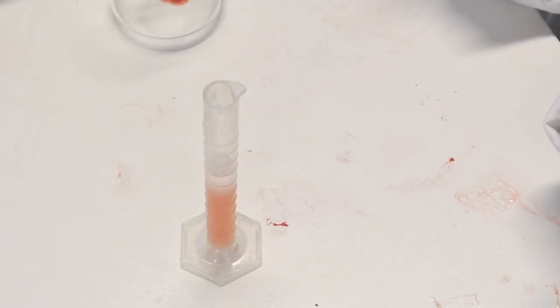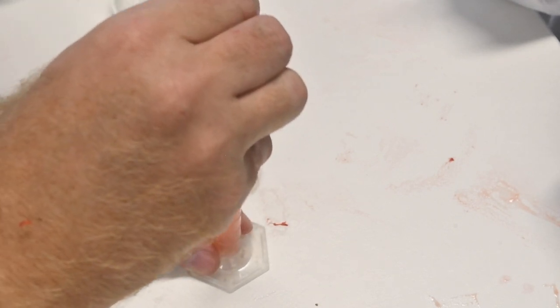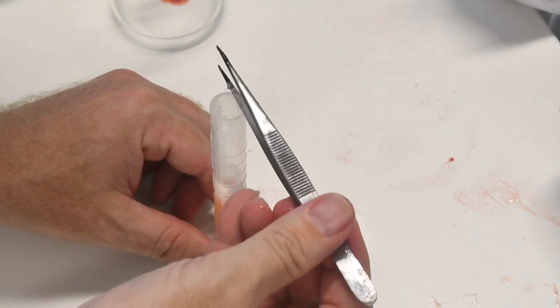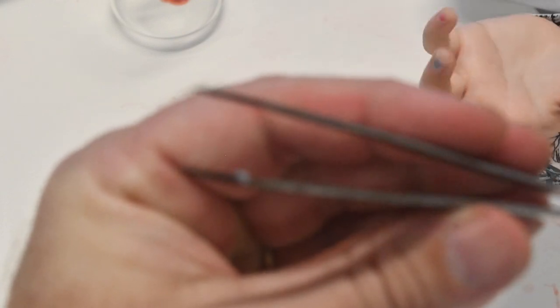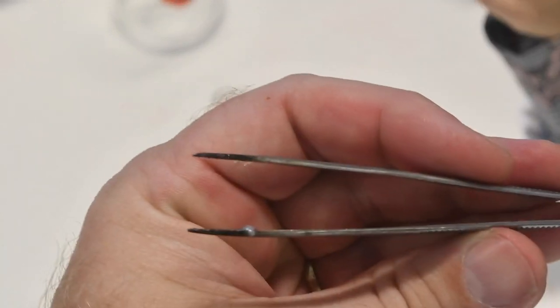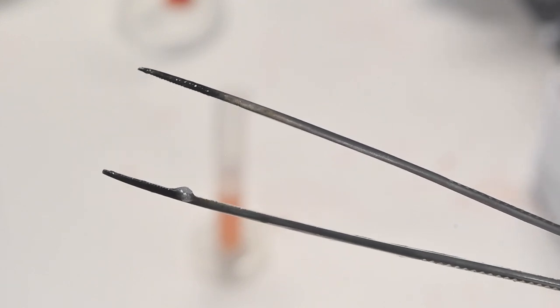Now what we want to try and do is, I might use the forceps, try and get some of the DNA out of here. If I can do this properly. But I can't see it. Okay, the tiny little glob there. I can't see it. Look. Now that is DNA. If I can get it to focus. That is the DNA on the edge of the forceps.